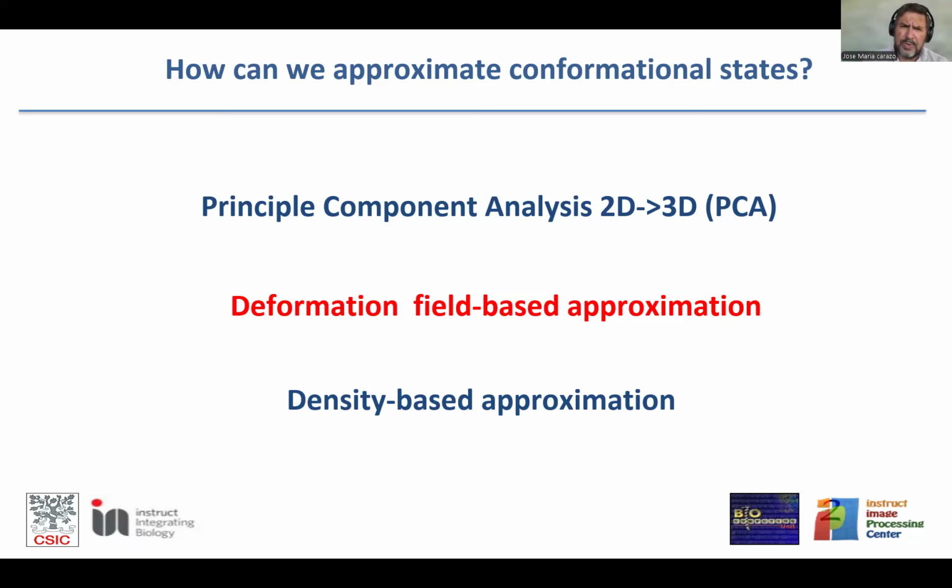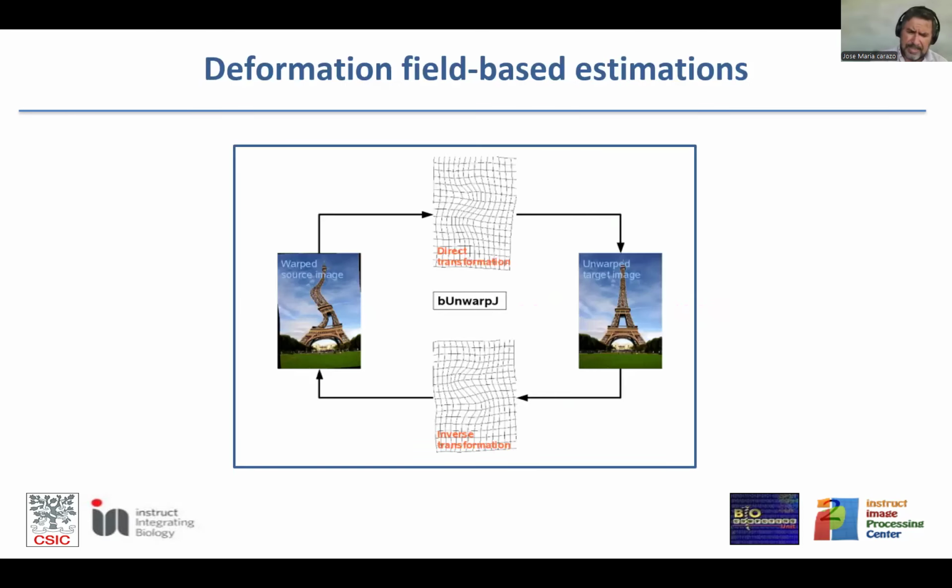Then we started to develop other methods. And really, the field right now divides into two types of methods. One is deformation field-based methods, and the other are called density-based methods. The deformation field is the following. Listen, I'm not interested in those cases.